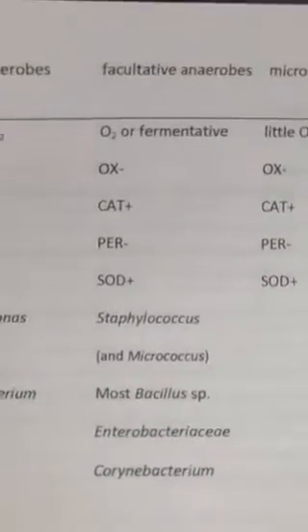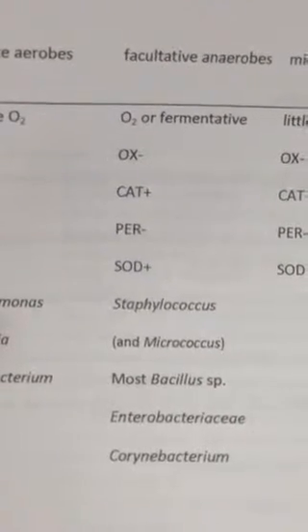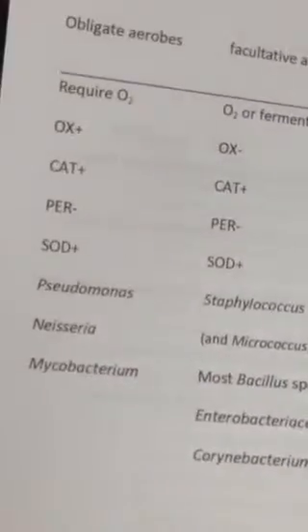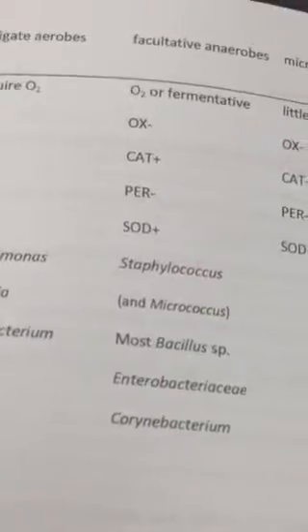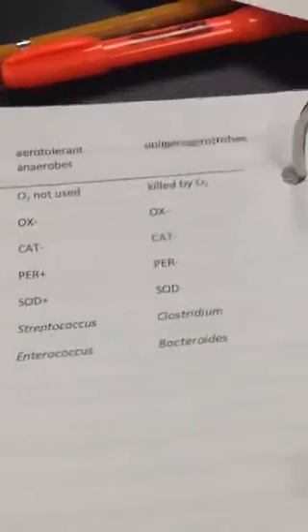Oxidase test. All your Enterobacteriaceae are oxidase negative. If it was oxidase positive, your bacteria would have turned blue when you put this reagent on it. Okie dokie. What else was I going to tell you about?